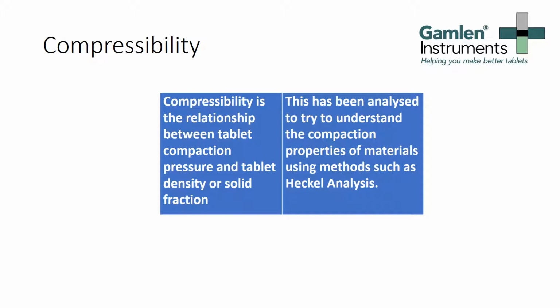Compressibility is the relationship between tablet compaction pressure and tablet density or solid fraction. This has been analysed to try to understand the compaction properties of materials using methods such as the Heckel analysis and the Kawakita analysis.